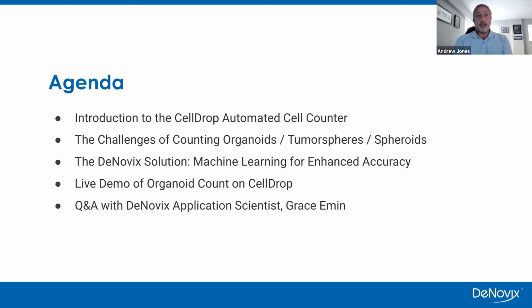And the majority of today's session really would be taken up by a live demo. So we'll switch to the lab in Wilmington in Delaware for a live demo of some organoids that we have prepared in our lab. And we'll also then put some time aside for a Q&A at the end of the presentation with our scientist who'll be giving the presentation today, Grace Emin.